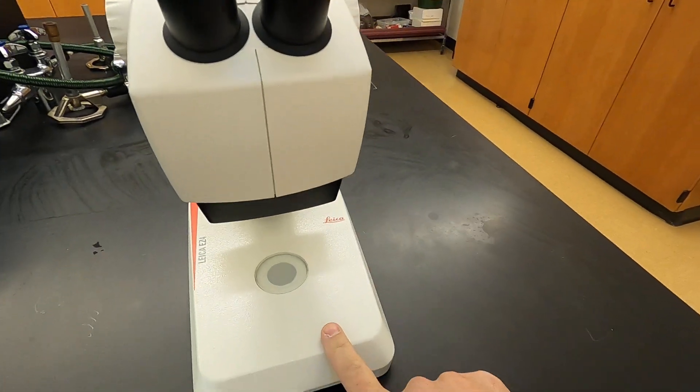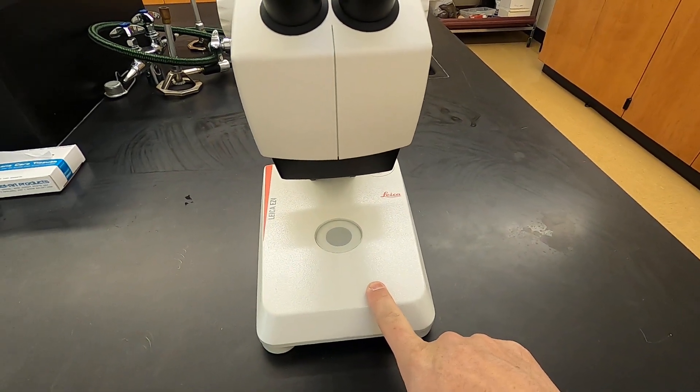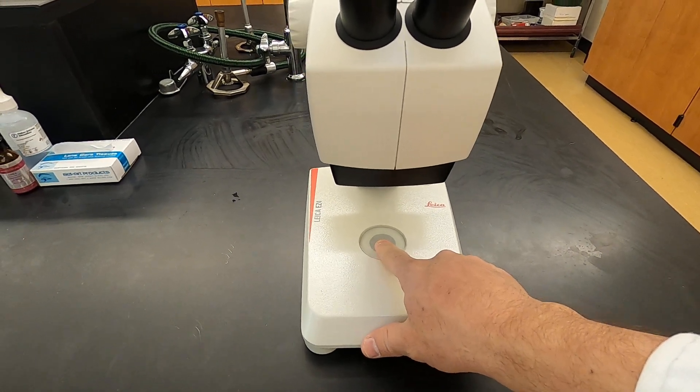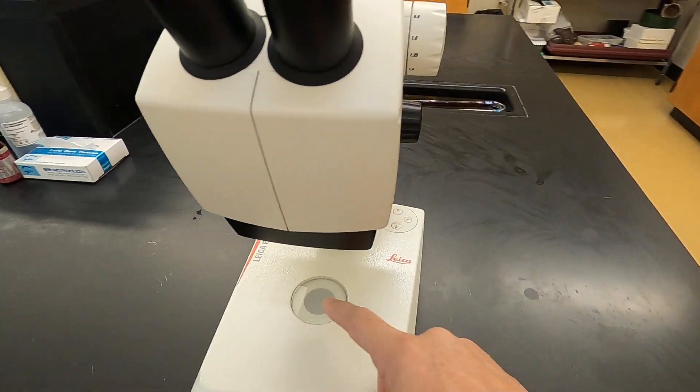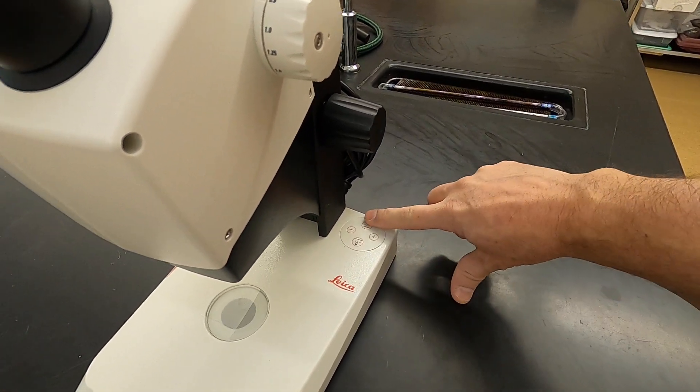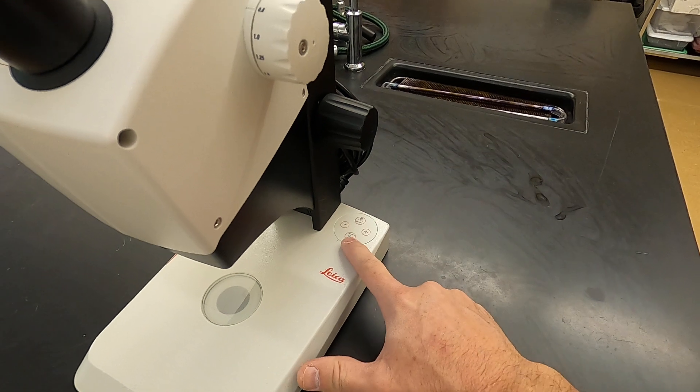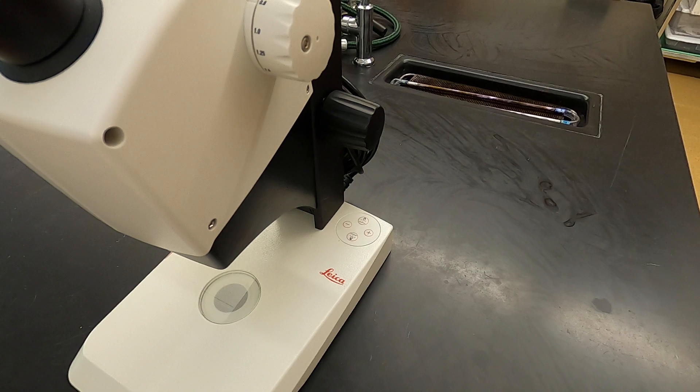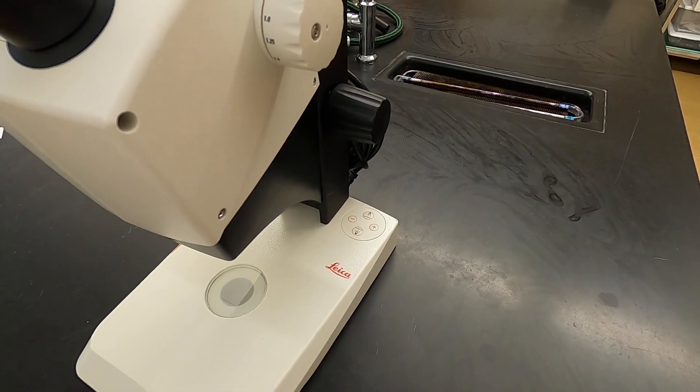Here you have the stage, and set inside the stage is the light source. Once it's plugged in, the controls are over on this side. We can have the light shining from above or below, and we can increase or decrease the intensity with either of these buttons.